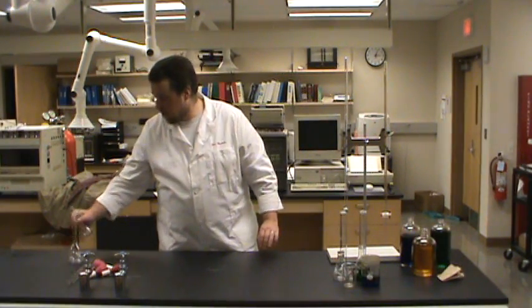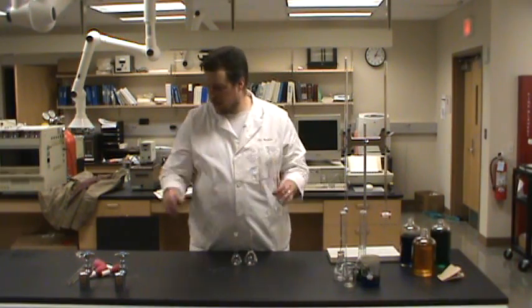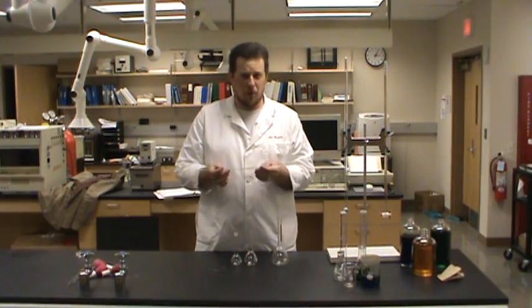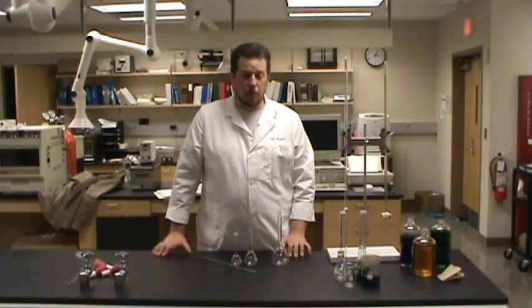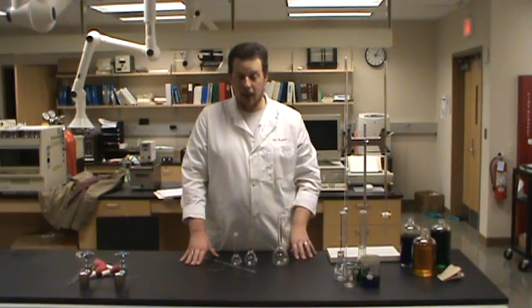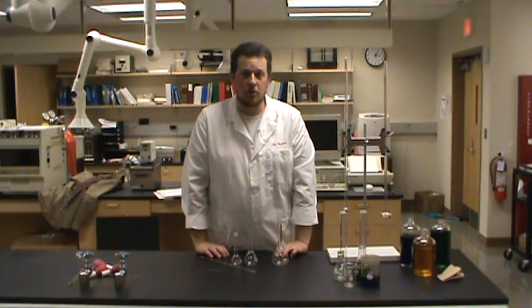And the other class of glassware that we're going to be using on a pretty regular basis is volumetric glassware. And volumetric glassware is volumetric flasks and volumetric pipettes. We're going to put those in another video. So for now, make sure that when you're picking out the glassware that you want to use, you match the glassware to the task at hand. And don't forget to watch the video on volumetric glassware coming up.